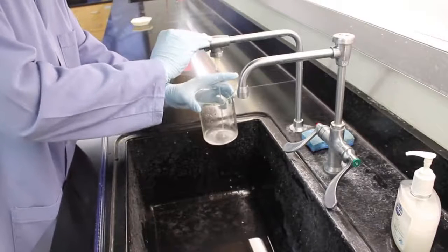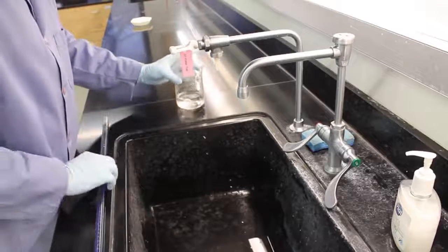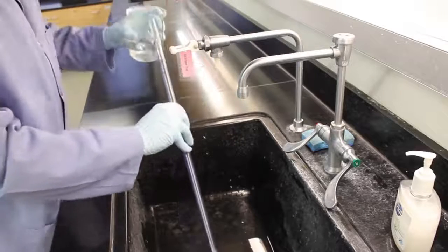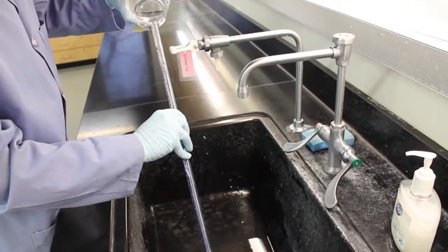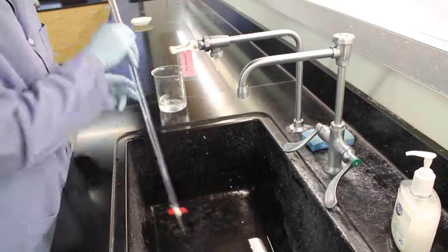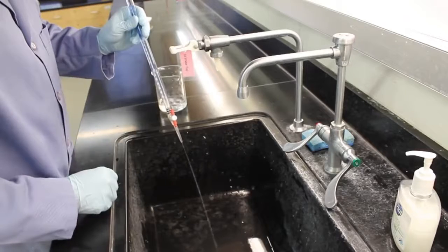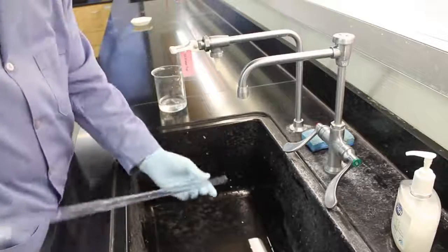I recommend cleaning your burette first because you have no idea who used it last or what was inside of it. In order to do this, you will need to wash it with deionized water at the sink. Typically, you would do this 2 or 3 times to ensure the burette does not have any impurities still inside of it. We use deionized water for cleaning to prevent chemicals from the tap water from contaminating our burette and throwing off our calculations later.